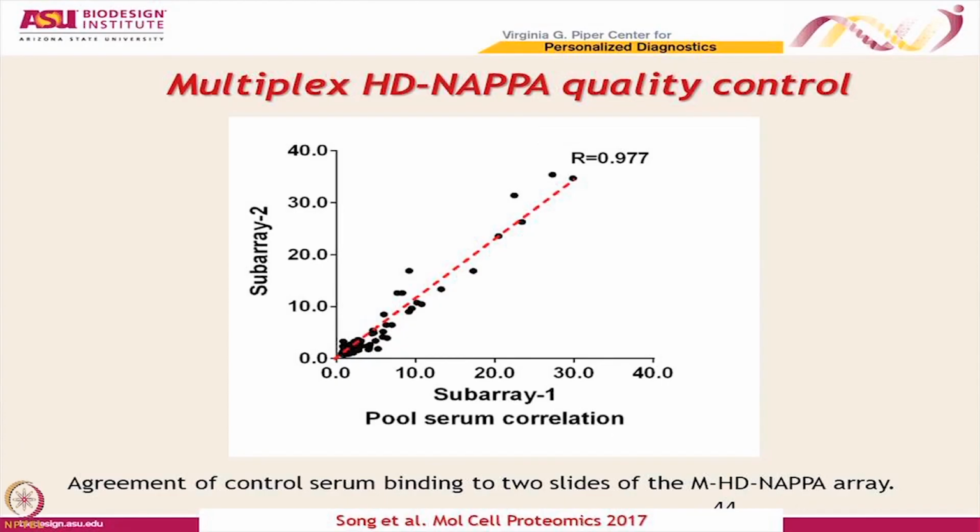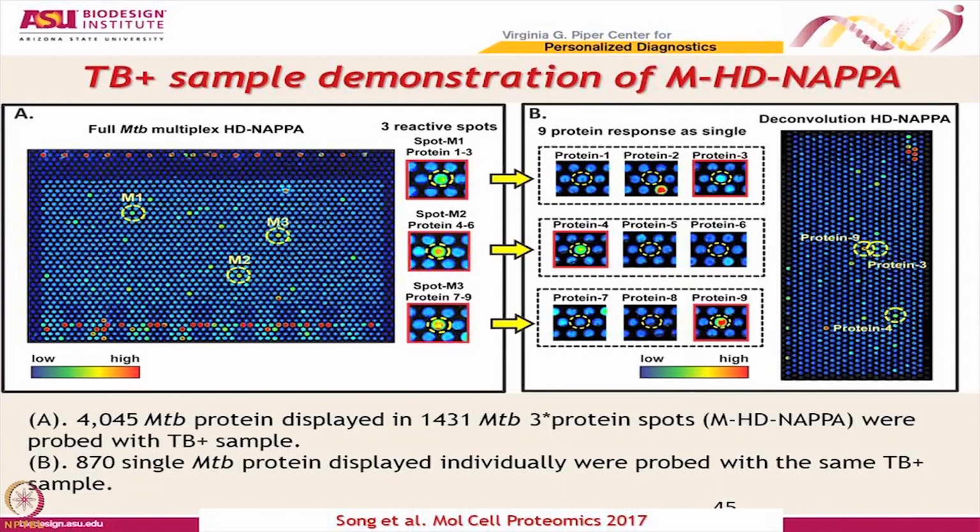And then when we did our screening experiment, once again, we wanted to make sure that we were getting the same result day to day. And so here you see 2 different arrays, 2 different days, and again, you're getting very good alignment there. So this is kind of what you end up with.